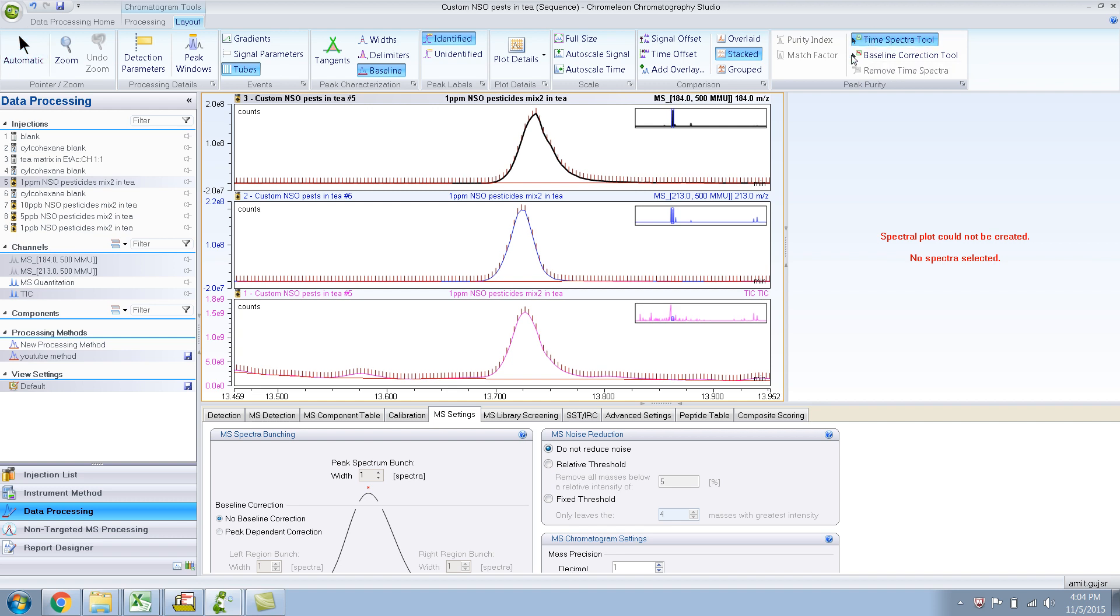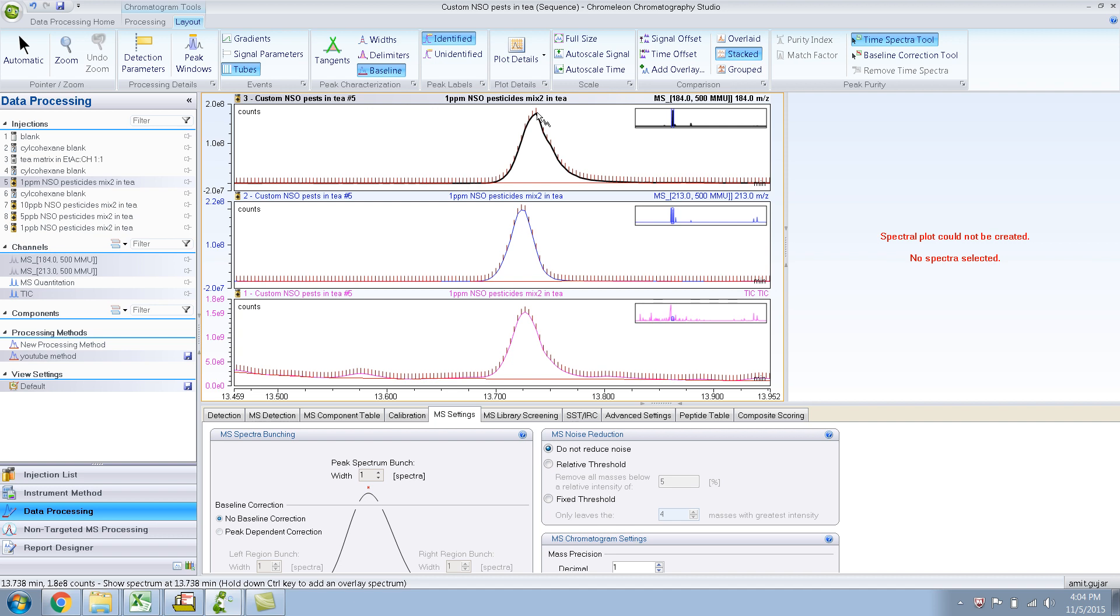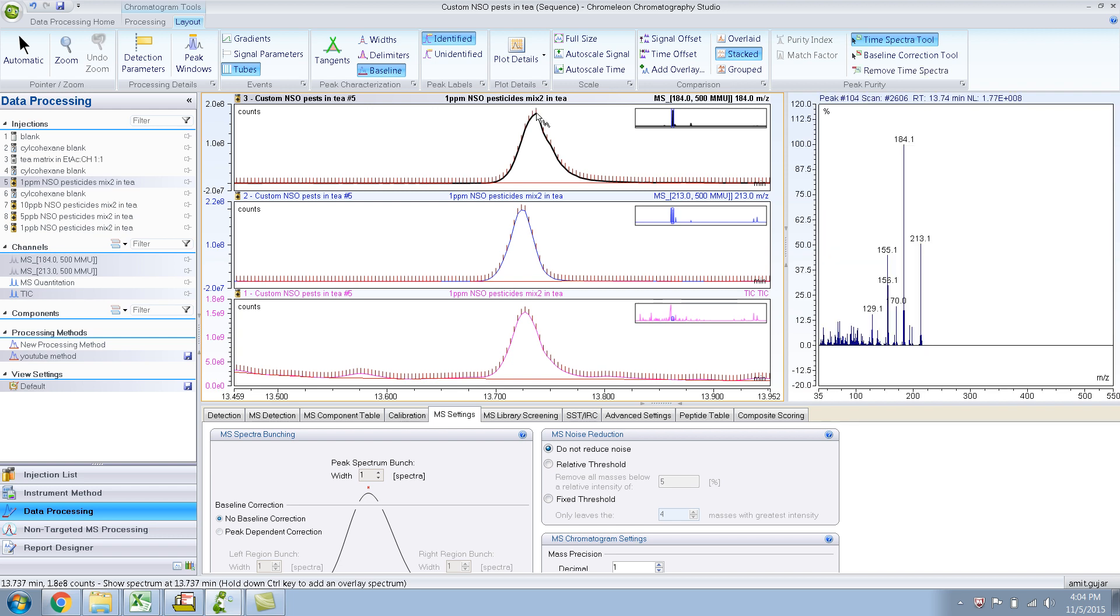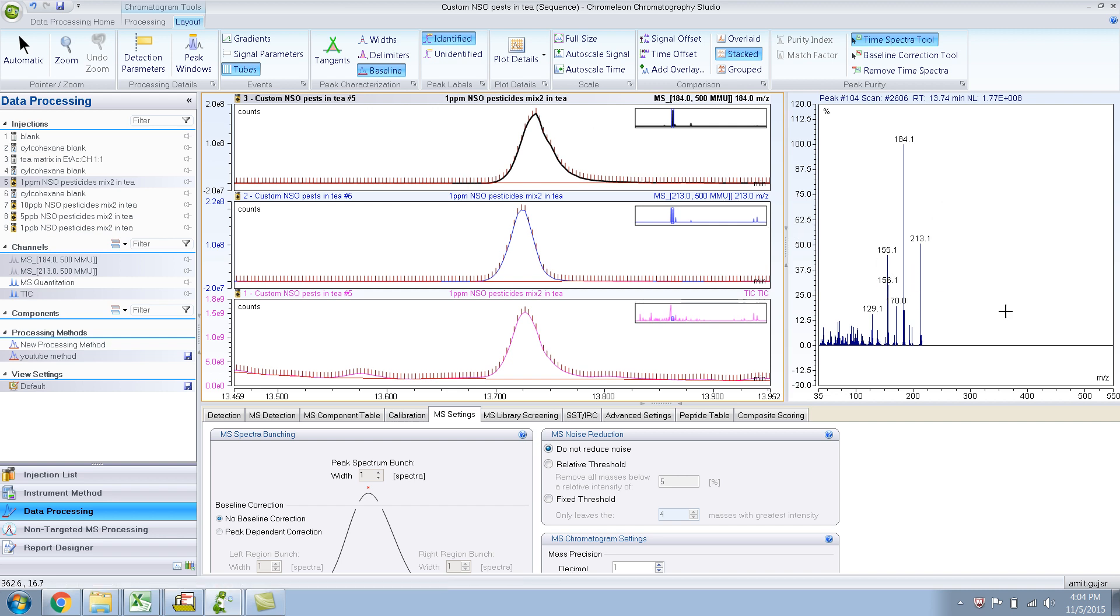So when I choose this, you will get this funny looking - I don't know what it is - some kind of looks like electric lightning or something like that, bolt or something. So let me do that, and when I do that, it will show me on the mass spectra pane the mass spectra for that point.